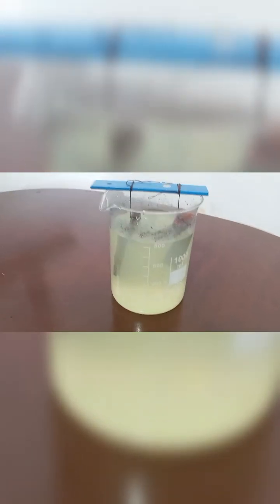Plate the silver onto copper. Suspend two clean copper sheets in the solution. The silver in the solution will plate onto the copper surfaces.